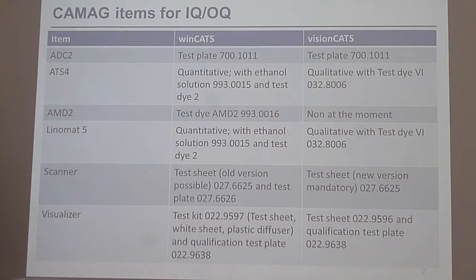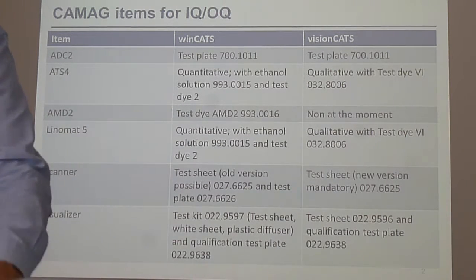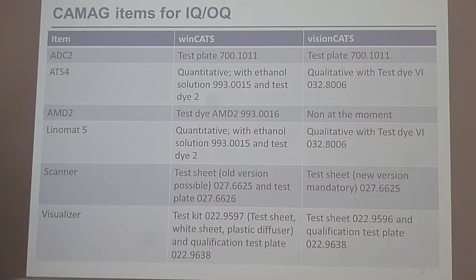And sending around takes 2 weeks. So this one is at least 6 to 8 months valid here. The reason is that there is a date printed on it, and when we order it, it's 1.5 years. Then we say we have around not 1 year storage, so it's valid from 6 months up to 1 year, and the test plate was 2 weeks. So you have to really hurry up to make that.